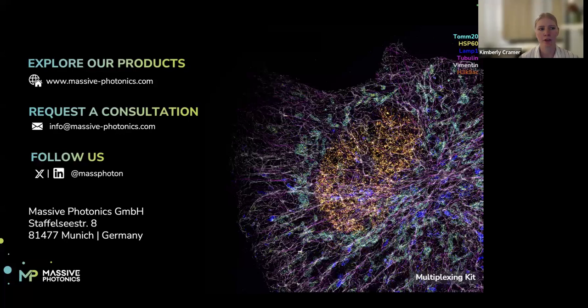Here there's not a huge limitation, because you really only need one good or great DNA-PAINT dye to do everything I showed you today within the webinar. That dye is Cy3B, which is the best DNA-PAINT dye, so people typically use it when they want the highest resolutions. So you really only need one good dye; there are really no limitations there.